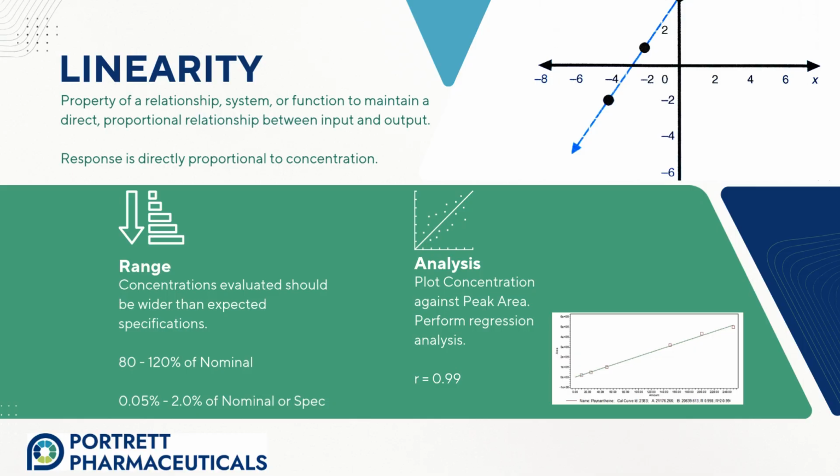A response is most commonly the peak area of the analyte in a chromatogram obtained by HPLC or GC. Other responses can be absorbance values, volumes of titrant, and others. Most methods need to show a linear response.